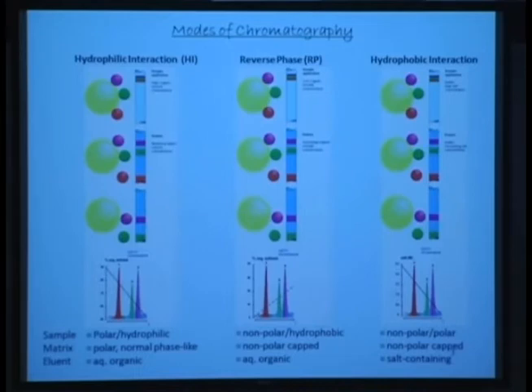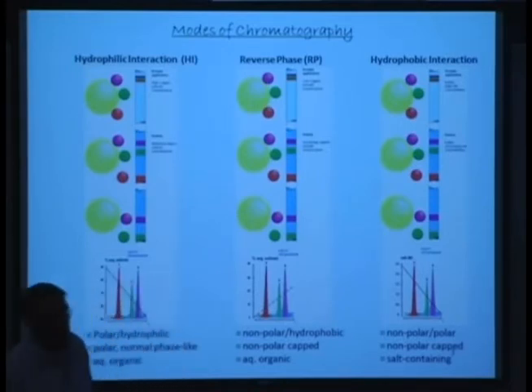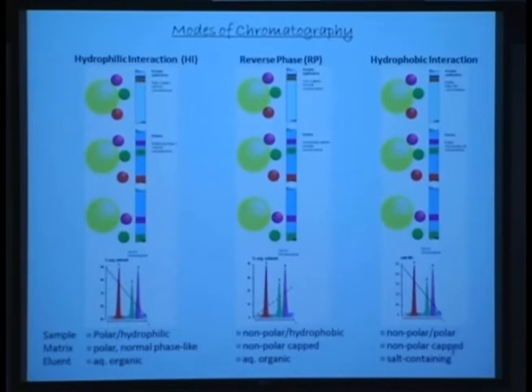This carbohydrate molecule can be loaded with an appropriate hydrophobic group. A number of times we can introduce that, or a number of times the carbohydrate itself has a hydrophobic group. He didn't talk about those molecules because he ran out of time, but there are, for example, glycolipids, right? Glycolipids are molecules that have a hydrophobic group. So for glycolipids, one of the techniques that is typically used is reverse phase.